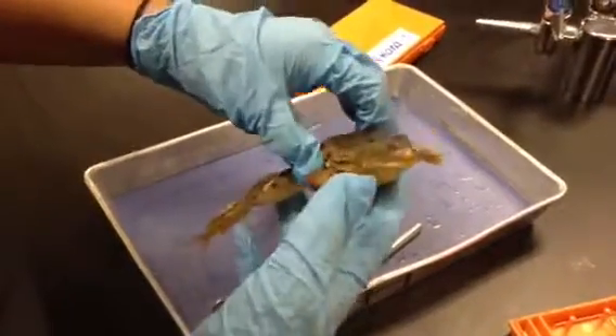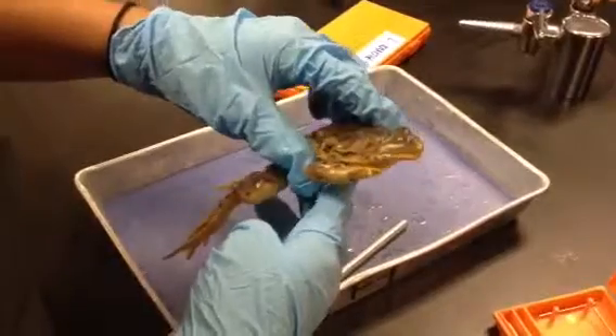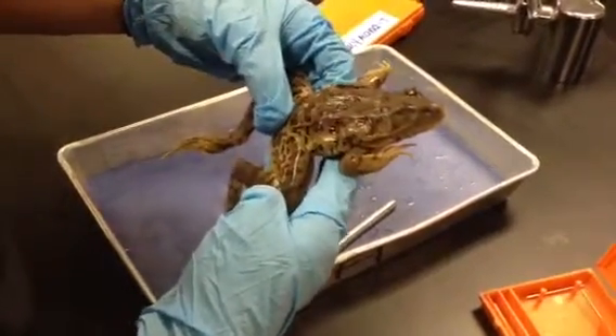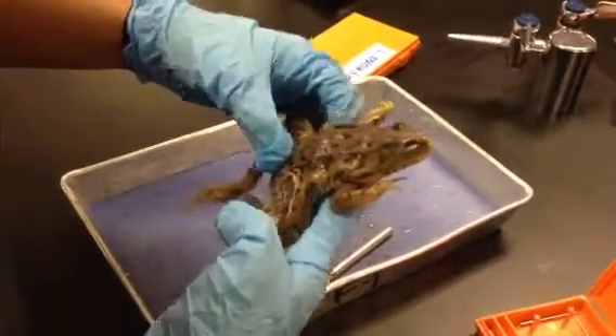Hi, this is Maddie, and my partner's name is Demetria. We're with Swimmy, who's a female frog that is approximately 11 centimeters long. Today is frog dissection day one, and we're going to be discussing the external structures of the frog.